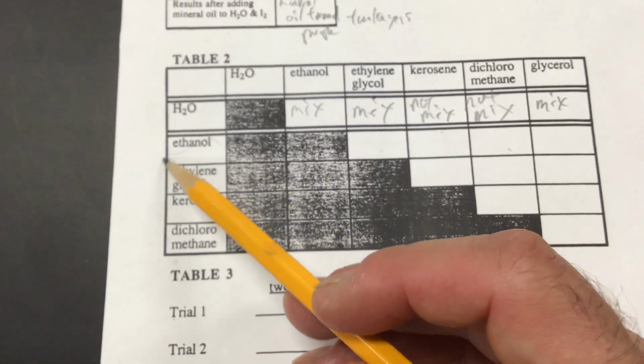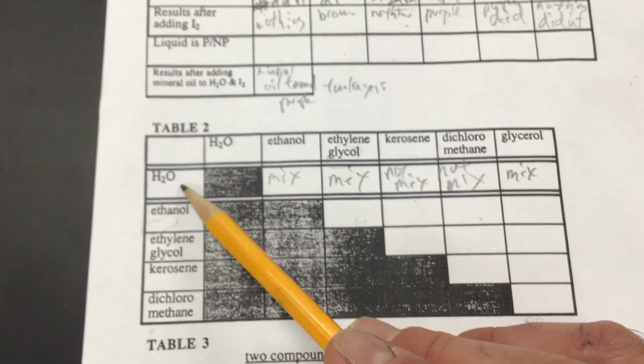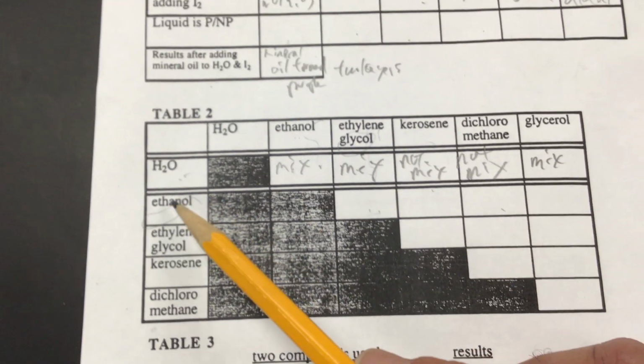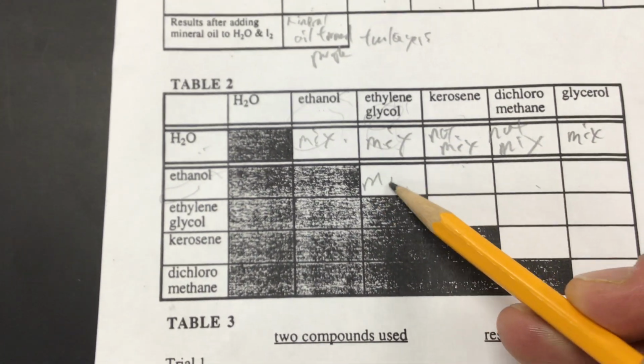So if you took ethanol and ethylene glycol and mixed them together, what would happen? If water and ethanol mixed and water and ethylene glycol mixed, then these 2 should mix with one another. So go ahead and complete that table.